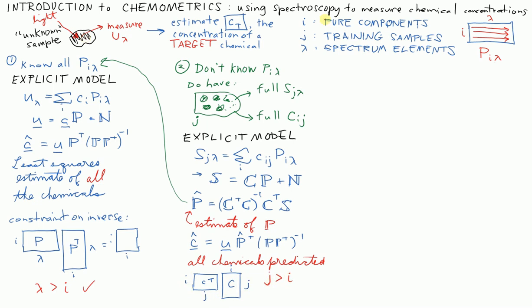So this is a significant constraint now, that if there are, say, 10 biochemicals whose relative concentrations are varying in an average sample that you're trying to measure, you've got to make at least 10 or 11, preferably 20 or 50 measurements of samples with different combinations in order to have this technique work for you. But you still had to do a lot of work in this technique, you had to measure all of the chemicals' concentrations, and we only want to predict glucose.